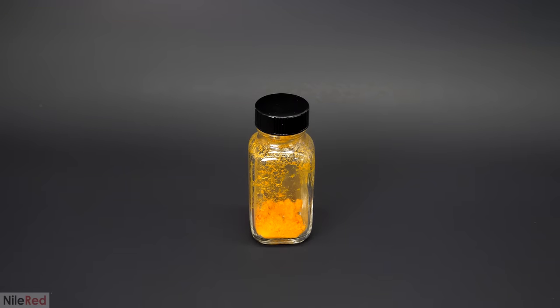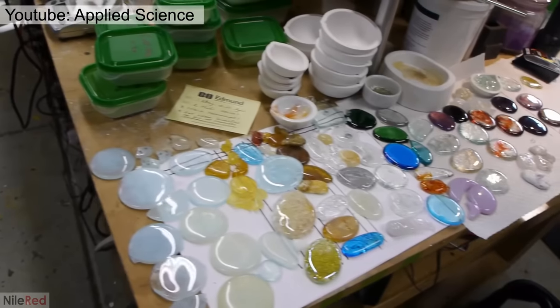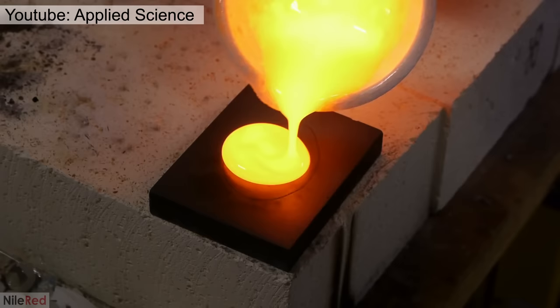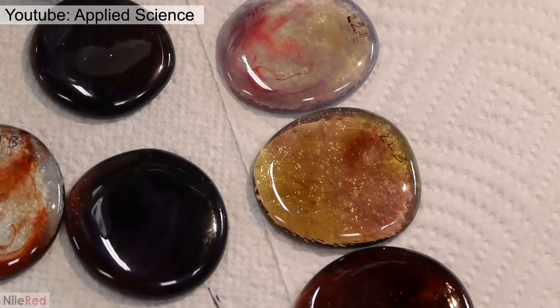Now that I had the sodium diuranate, I could start trying to make the glass. However, I'd never made glass before so I kind of had no idea how to do it. I looked around online and one of the best things I found was a video by Ben who runs the channel Applied Science. He gave a lot of good details and tips, and almost everything I'll be doing here is based on stuff I learned from him. I also got a few tips from Andy who runs the channel How To Make Everything. When it comes to making glass, it's not super straightforward and there are a lot of different ingredients that can be used.